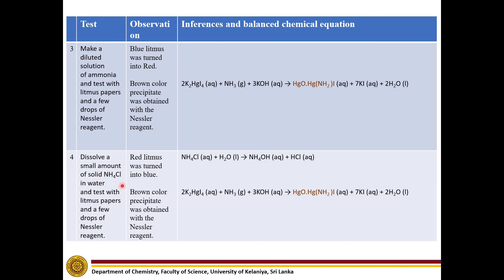In the last step, ammonium chloride solution turns red litmus into blue. Also, with the Nessler reagent, it gives the same brown color precipitate.